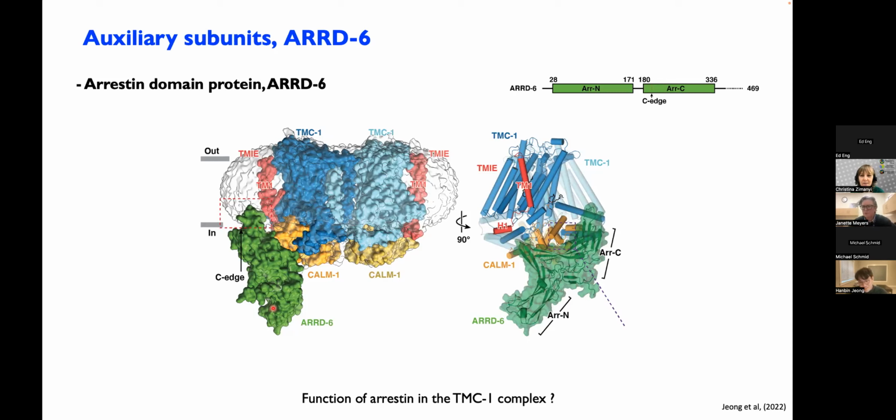I assume part of the reason you picked it is because it helped with changing the particle orientation. Yeah, right. I think it not only changed the particle orientation, but also improved the contrast of particles. As I mentioned, treating with amylamine tends to make the ice thinner, so it helped to improve the contrast of particles. Okay, that was a nice bonus.